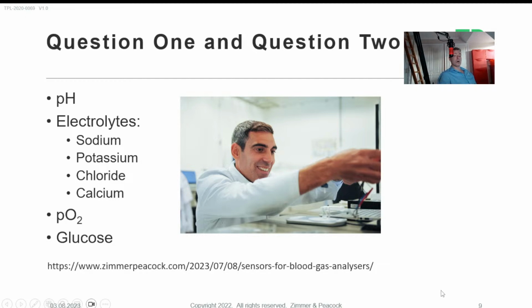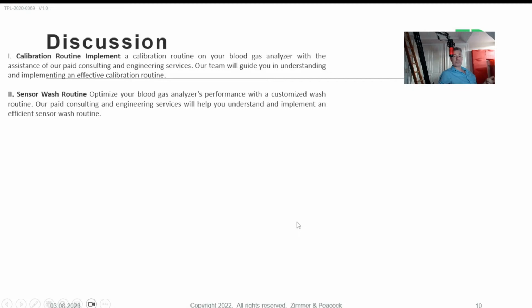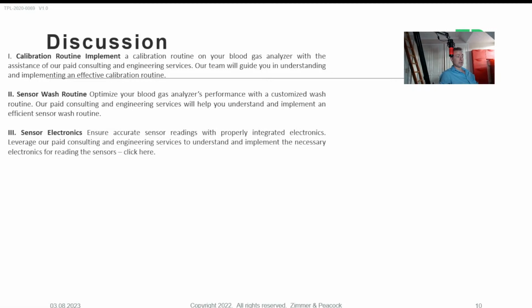After this webinar, I will go on and edit and make sure I try and get all the links underneath the video. So on that page, I do have a discussion about the question about accuracy and about the length of time that sensors can be used for. It really comes down to some of these points, which is, what is the calibration routine that you're going to implement? If you don't know, contract with ZP. What's going to be your sensor wash routine so that you can test lots of different samples on the same sensor? If you're not sure, come and consult with ZP.